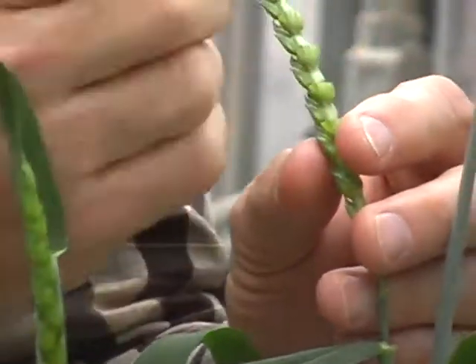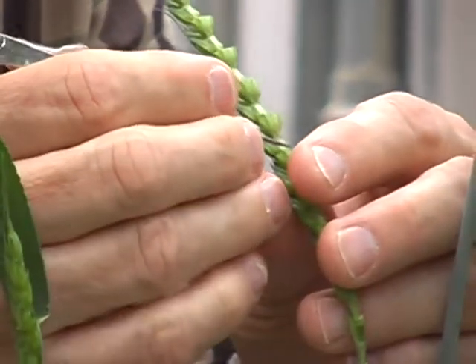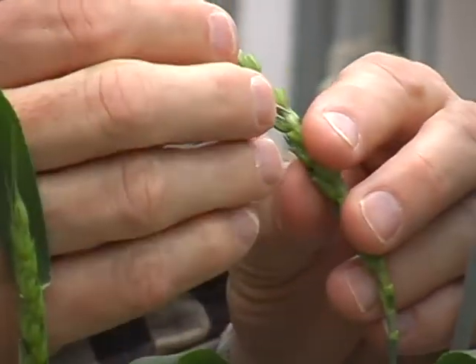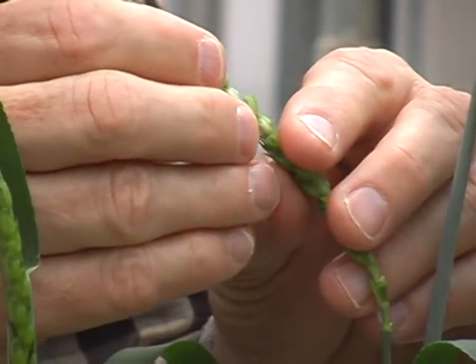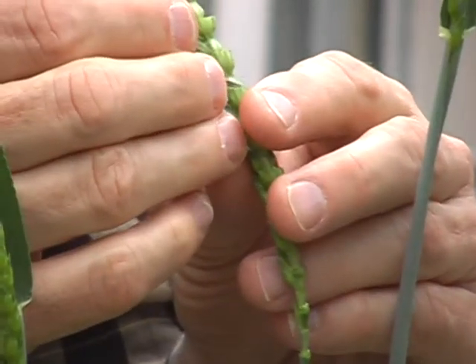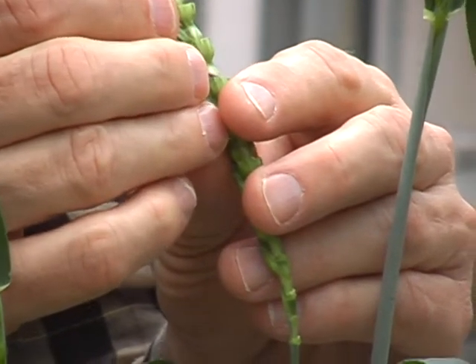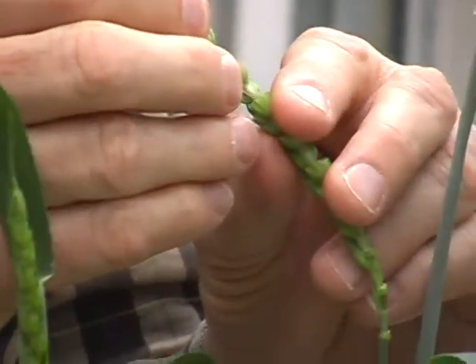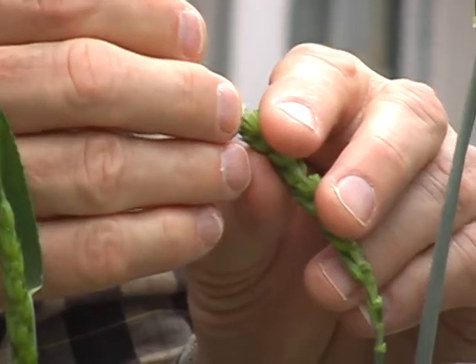We do this on both sides of the florets so that the whole head cannot self-pollinate. Wheat is normally self-pollinated, and the idea is that if we can remove the anthers so it can't self-pollinate, then we can pollinate it with what we want.